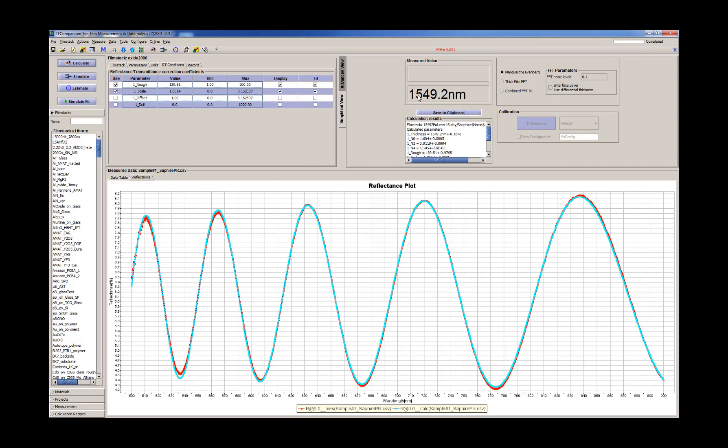So now we have almost perfect fit. The thickness is 1500 nanometers, 1.5 microns. So let's see what we can do now.